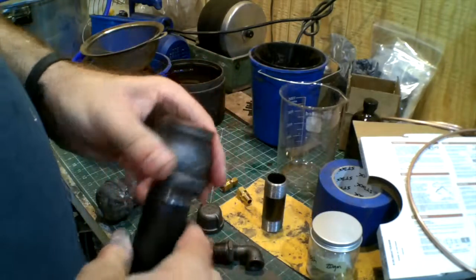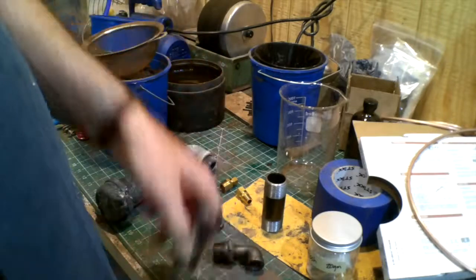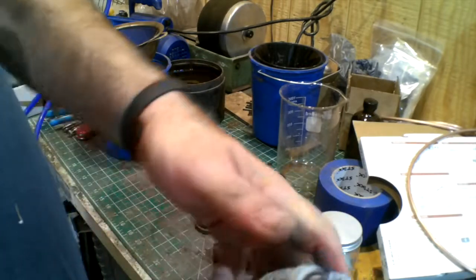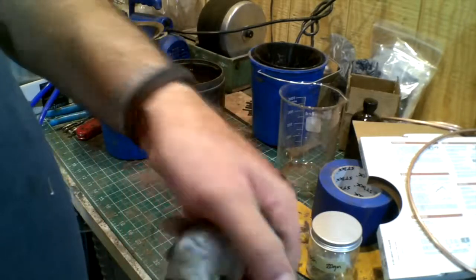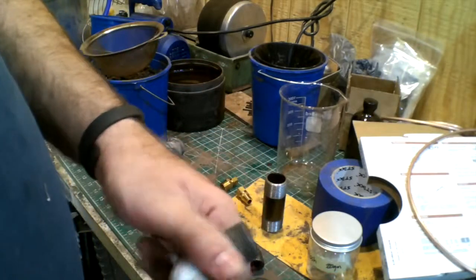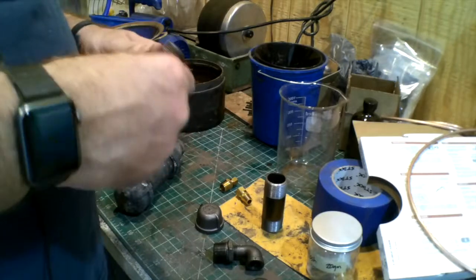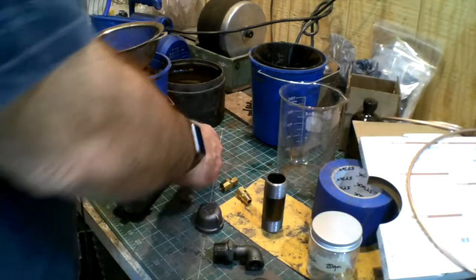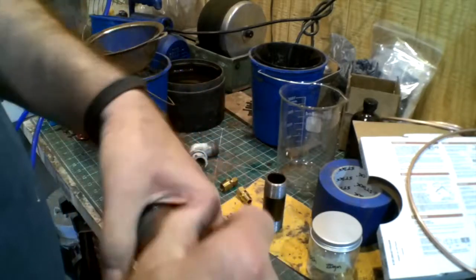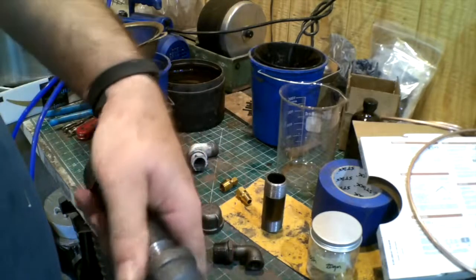Well, I don't have any sodium, but I do know how to react metals under high heat with carbon, because I've done that when I reduced my zinc and produced that zinc metal, which is inside this little elbow here. So that was kind of jazzy when I did that. The other thing is that this reaction takes place at an extremely high temperature, high enough that it's above the vaporization point of potassium. So essentially I have to distill the potassium off of the reaction, and I've done that too. So I know I can produce at least 1500 degrees because I melted this iron in the process, and I know how to put together a distillation setup.